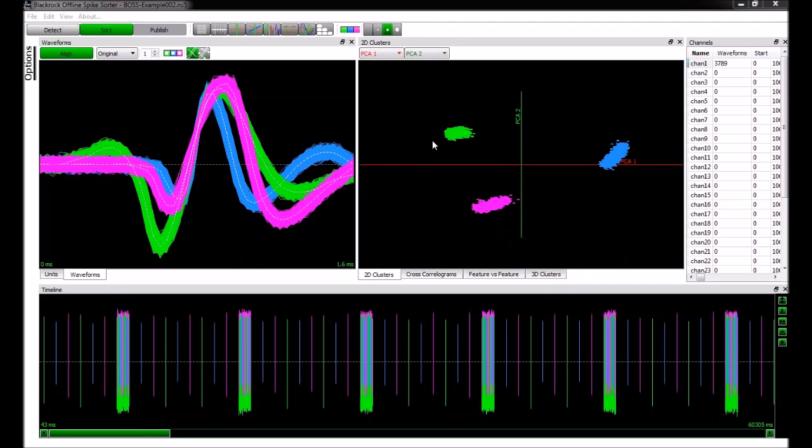There's another question that says, are there any tools planned for automatic single unit, multi-unit distinction? So looking at the difference, so auto detection of single unit and multi-unit activity, like waveforms, essentially.